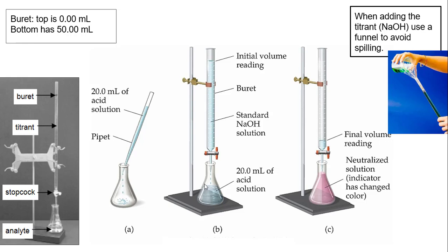This lab is written fairly well compared to the other lab flow labs, and it does cover that information. If you look at the burette, it begins at 0 and it ends at 50. You never want to go above this, and you never want to go past this. There's no increments. You wouldn't know the amount that you have. So if you start around 0, it goes down, and it'll go 1, 2, 3, 4, and let's say we stop here, and this is 23.25. You will take the final volume minus the initial, and that will give you the titrant volume.